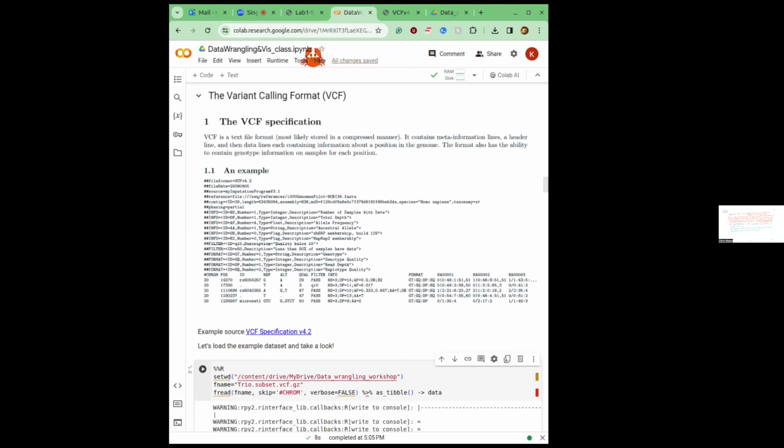So, a side note about tidyverse: it's very handy because it's very readable and very good in this way to explore your data. What is not good about it is performance in terms of time. If you have very large data sets, it takes a bit longer to parse. So in this case, I'm using data.table, which is basically the alternative. It has most of the commands that we have, just a different grammar to read this file.